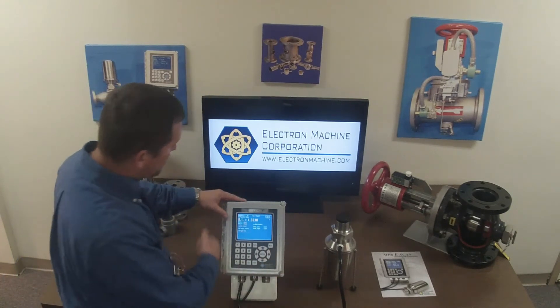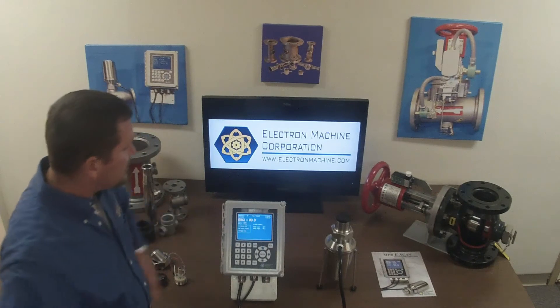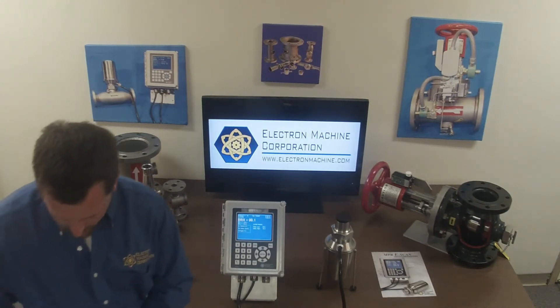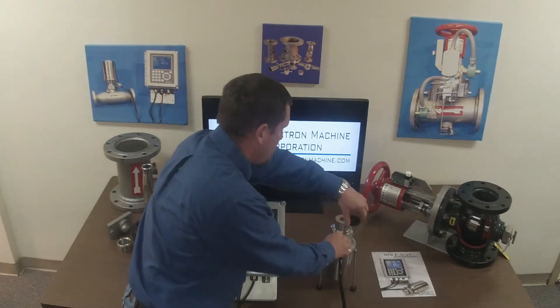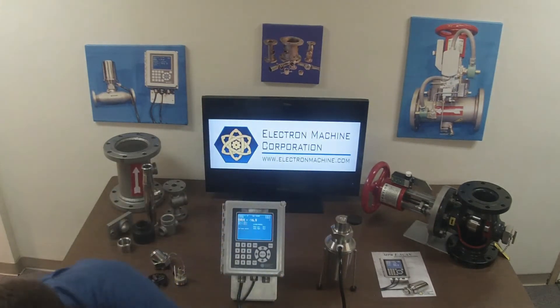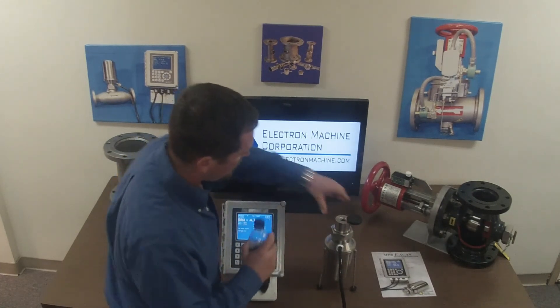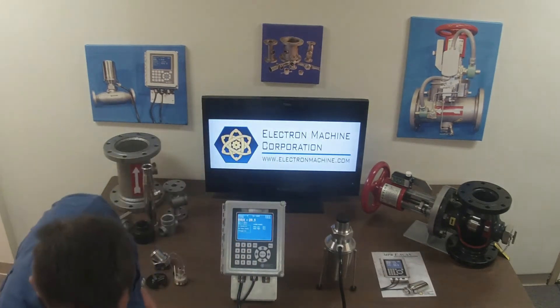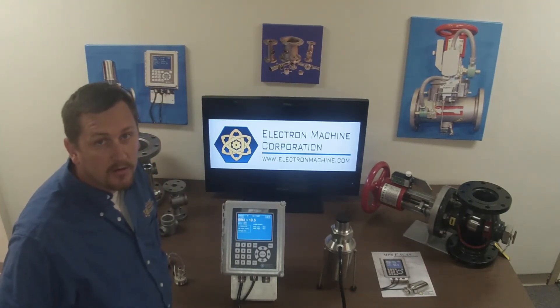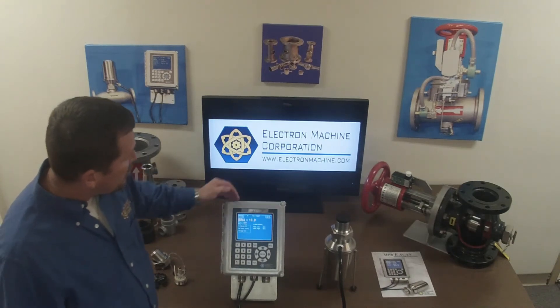This should give us a Brix reading of zero. Say you want it displayed in Brix instead of RI — we'll change the display and we're reading zero. Now we'll clean it off and put some soda on there. And now we're getting a Brix reading of 10.5, which is a percentage — basically our soda contains about 10% sugar. Something to think about next time you're drinking soda. That's a quick product overview of the NPR e-scan.